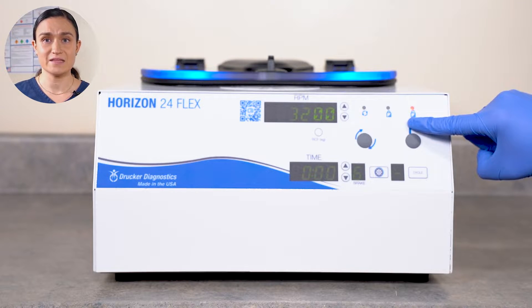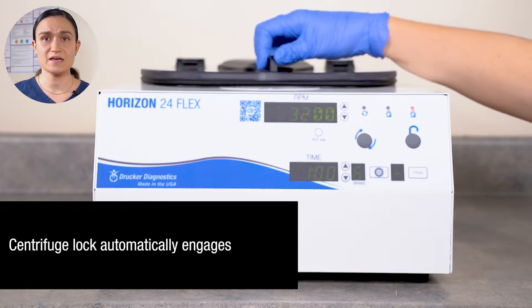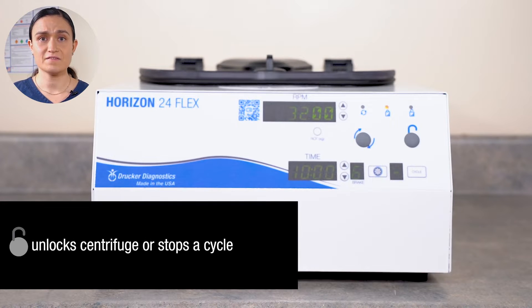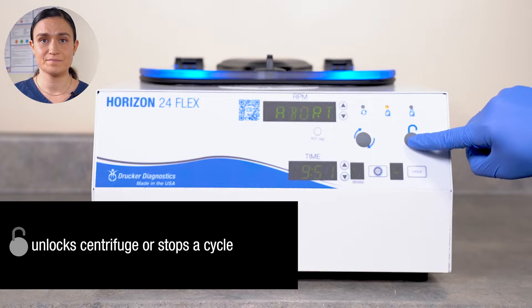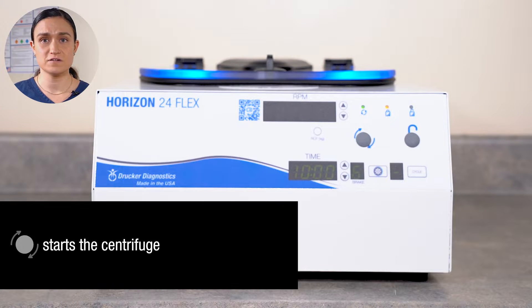The lid will automatically unlock at the end of a cycle, so you can twist the latch open and remove your samples. It will stay unlocked for 60 seconds — one minute. After that, it will lock again. If the lid is locked, you can unlock it with the Stop Unlock button. If the centrifuge is running, pressing this button will stop it mid-spin. The Start button starts the centrifuge. When you press Start, the Horizon 24-Flex will run whatever settings are currently displayed on its screens.